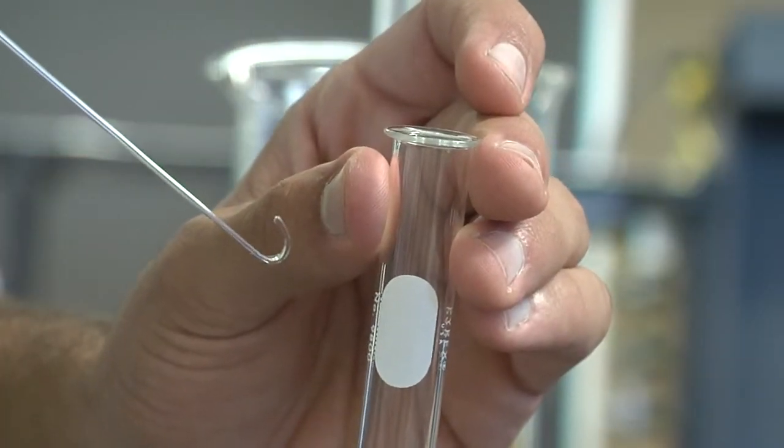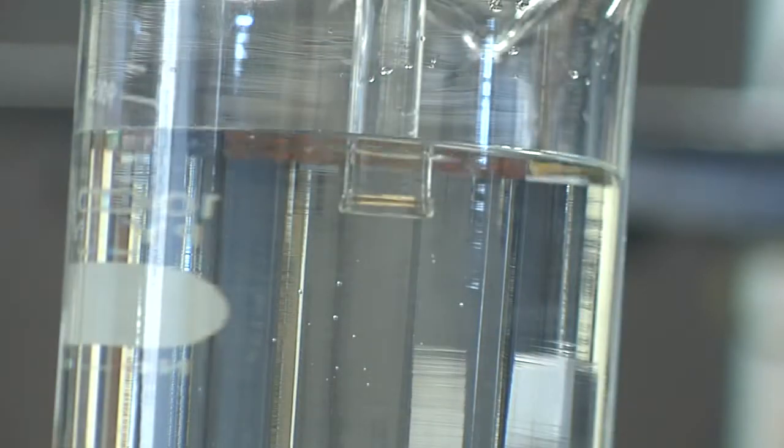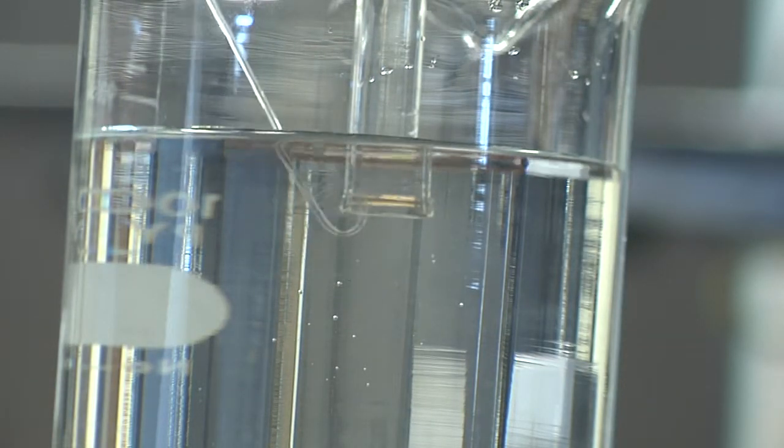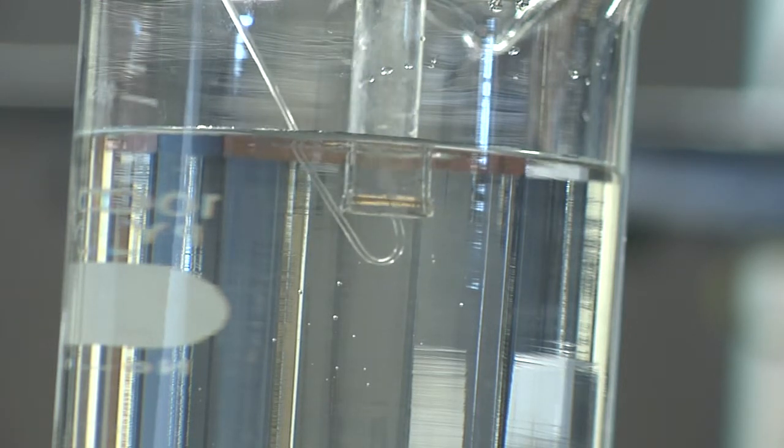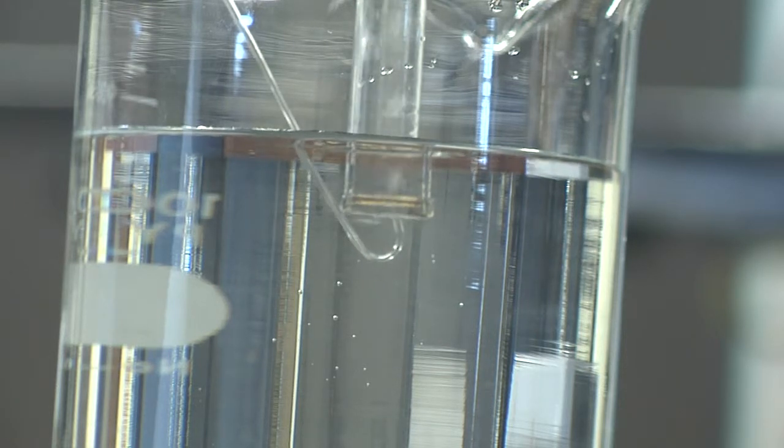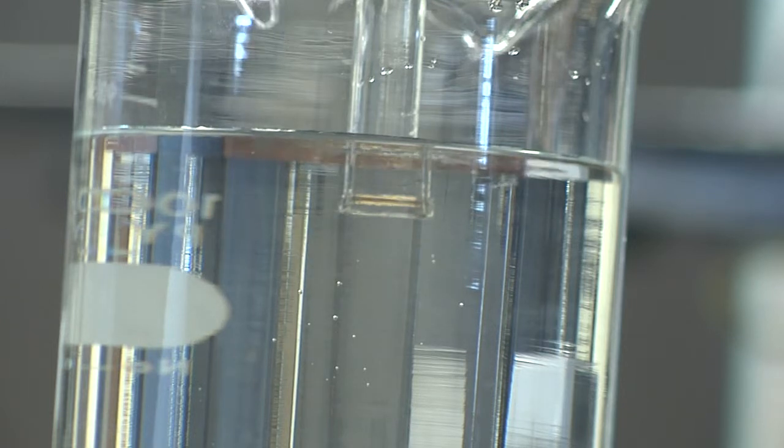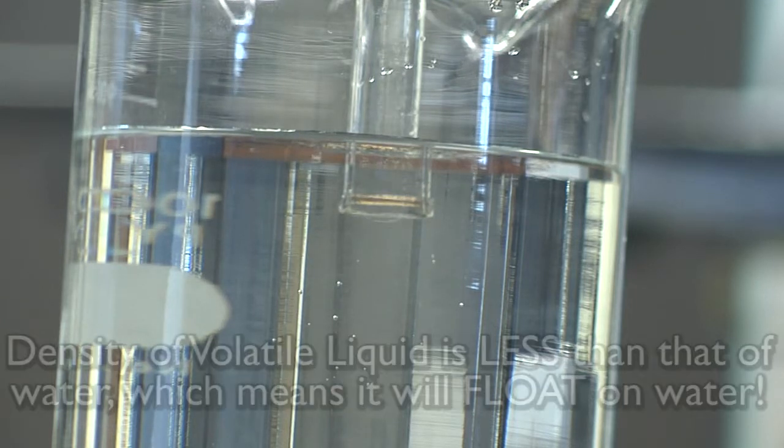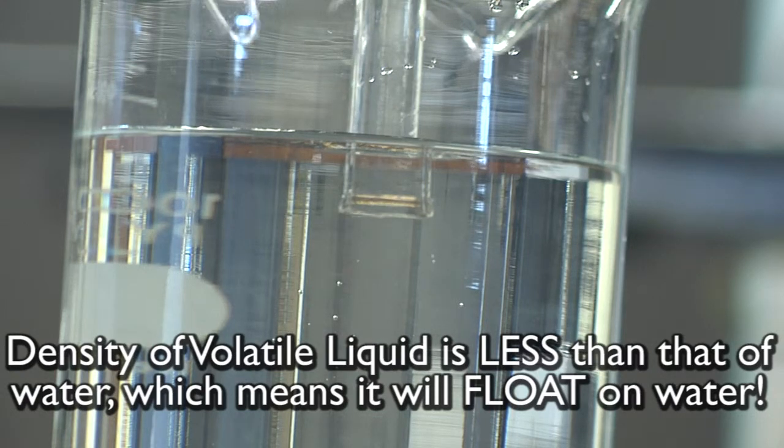And now, using a bent pipette, we are going to scoop up some of our liquid. Now comes the fun part. Using our bent pipette, we are going to insert a little bit of our liquid into the burette. You'll notice that the density of our liquid is lighter than that of water, so it will actually rise through the burette until it reaches the top.